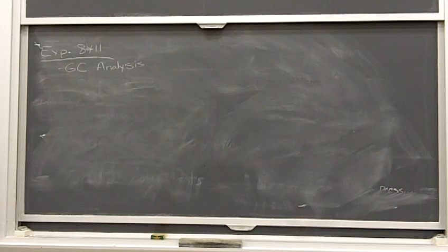Another thing that's not on there is potential ketones. So it's possible that you oxidized your alcohol at some point and made the ketone. Those ketones come slightly before the alcohols. They are not on the standard retention times, but you've got to remember to assign identity if you think that you have ketones, okay? So just be really careful in your analysis of the GC data. Anything you don't know what it is, you're going to assign unknown, but make sure you truly don't know what it is before you assign it to be an unknown, all right?